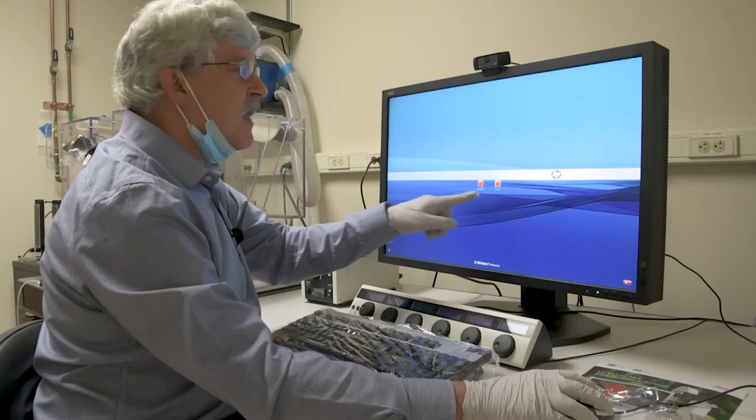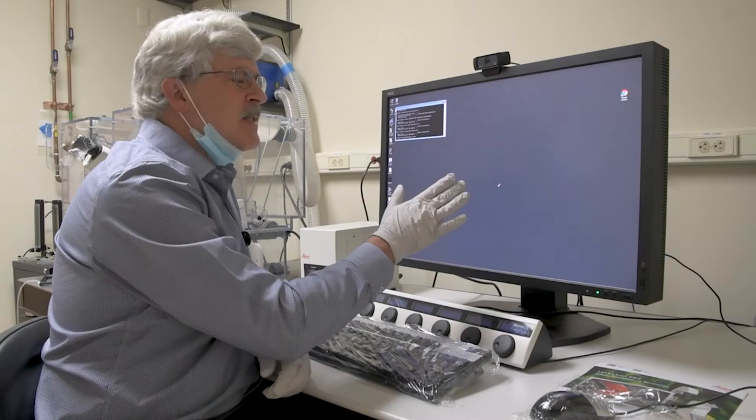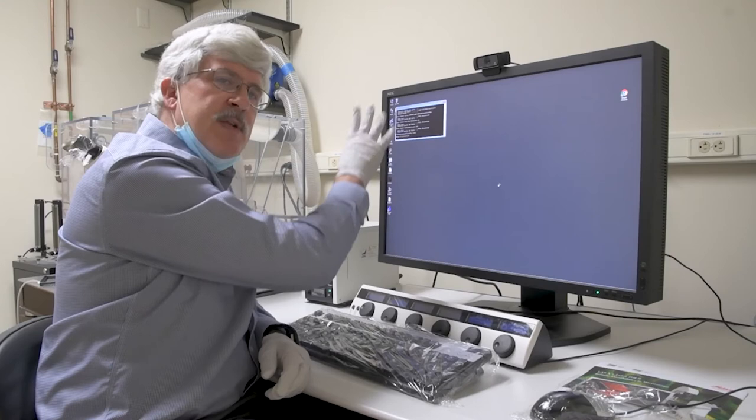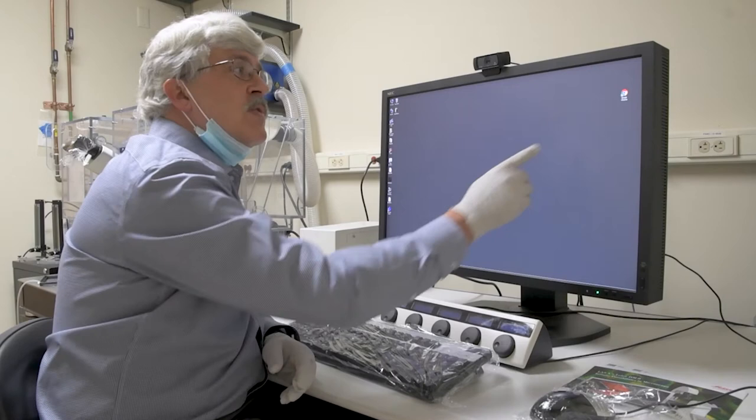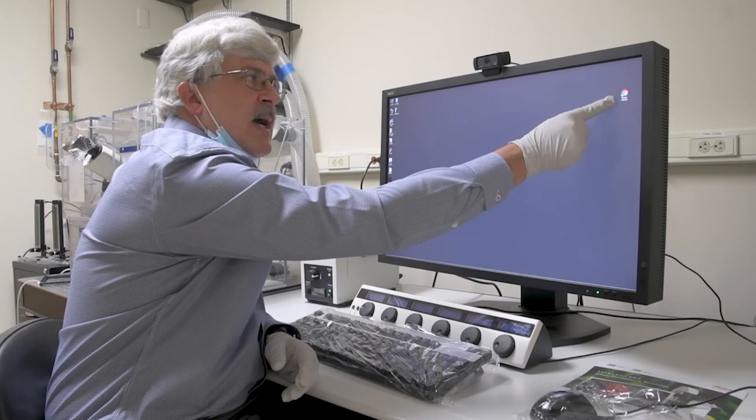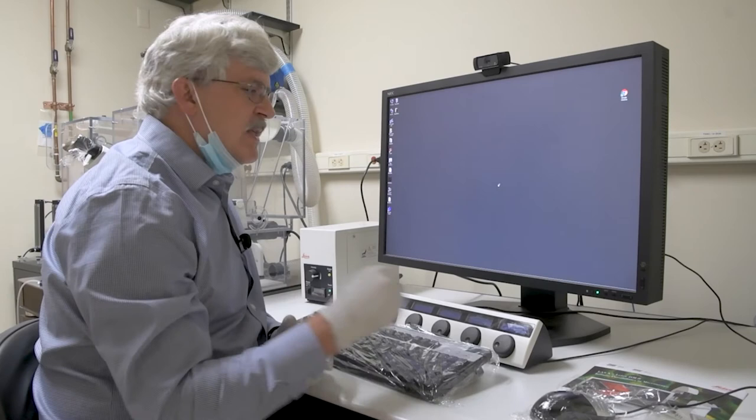Once the computer is started up, click on TCS user, put in the password, and wait for everything to start up. One of the things you'll see right at the beginning is this black box. Make sure it continues and does its whole job and turns off before you do anything else. This is connecting to the servers and making sure we're not having any interruptions or problems. The next thing you want to do is click into iLab. To do that, just double click on the Chrome icon in the top right hand corner. This will bring you directly to iLab so you can sign in and be responsible for your time.